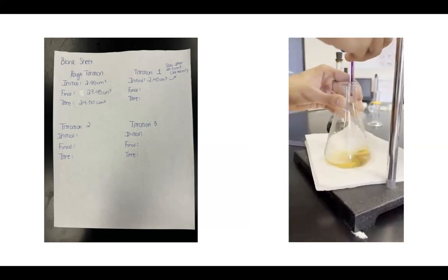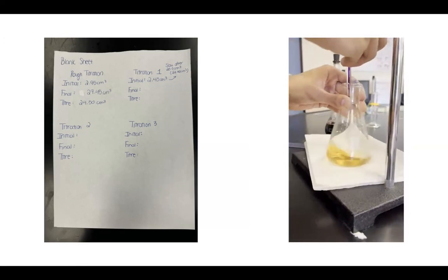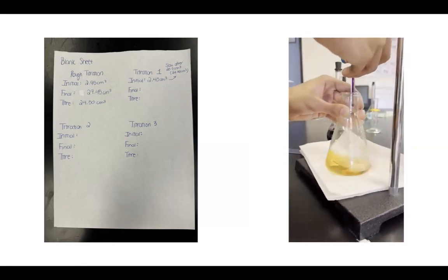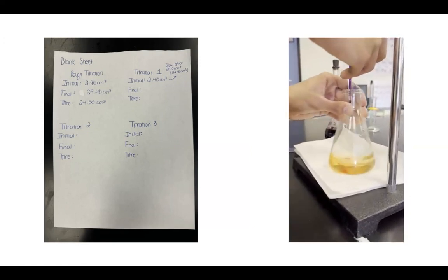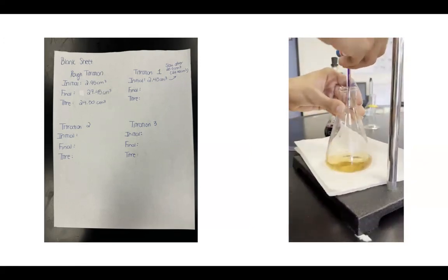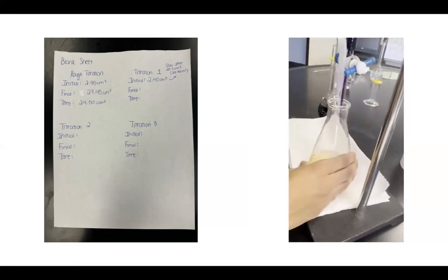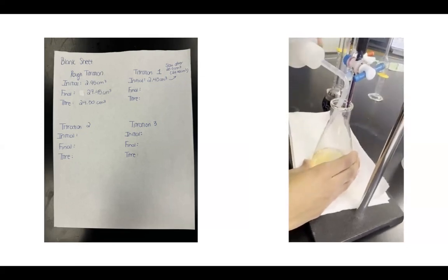Remember, we're being a lot slower and going drop by drop because these are the accurate titrations and will determine our calculations in part B of the question. As you can see, I got a drop on the side of the conical flask, so you can just rinse that with distilled water.